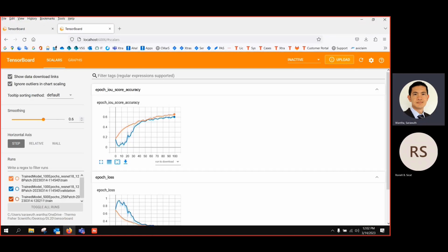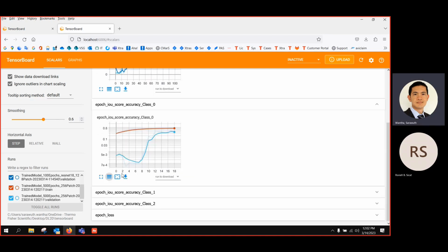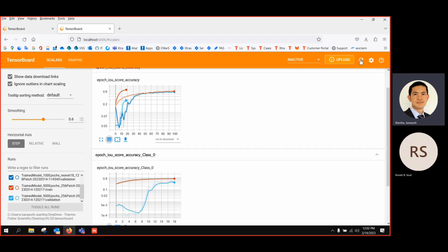So now you get another TensorBoard, and you can refresh them, and you can see the new train and parameter. Here you can see the red one and the light blue. Focus on the red and the light blue. Keep updating, and you should just go to a logarithmic scale to see if it's really converging. It may take a couple of seconds.